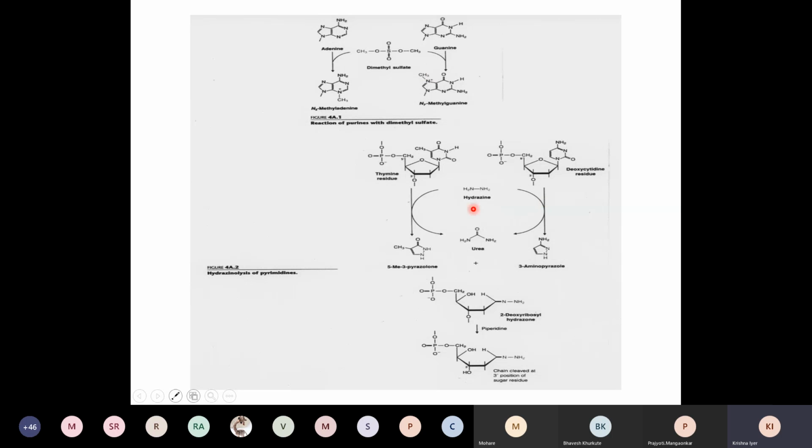Okay. Similarly, when I treat with hydrazine, whether it is cytosine or thymine, this ring here gets rearranged to a 5-membered ring, and then later on when you treat with piperidine, you will lose the base and you will cause a cut where that base was.